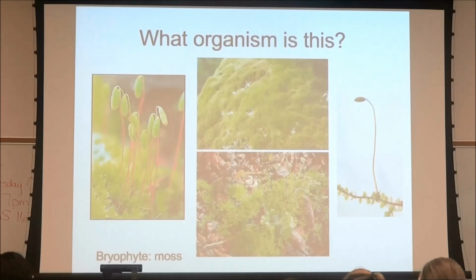It's growing low to the ground. And in this case, you can see the sporophyte with the capsule. So this is the living version of the guy that was in the glass jar on your tables. Okay? So this is your moss. You guys alright to switch it?